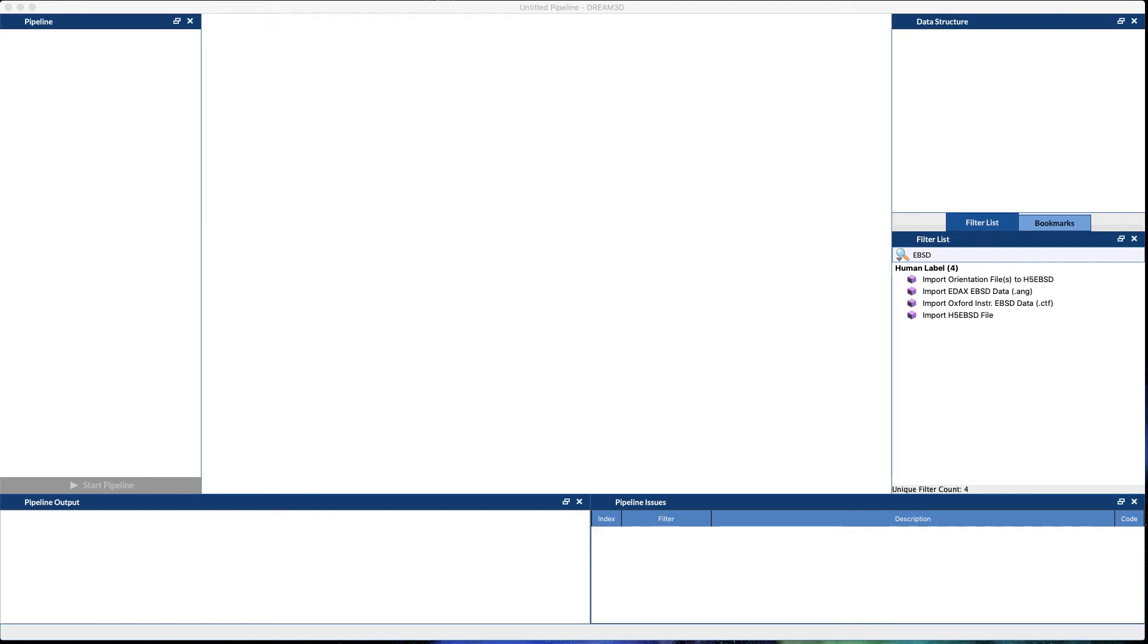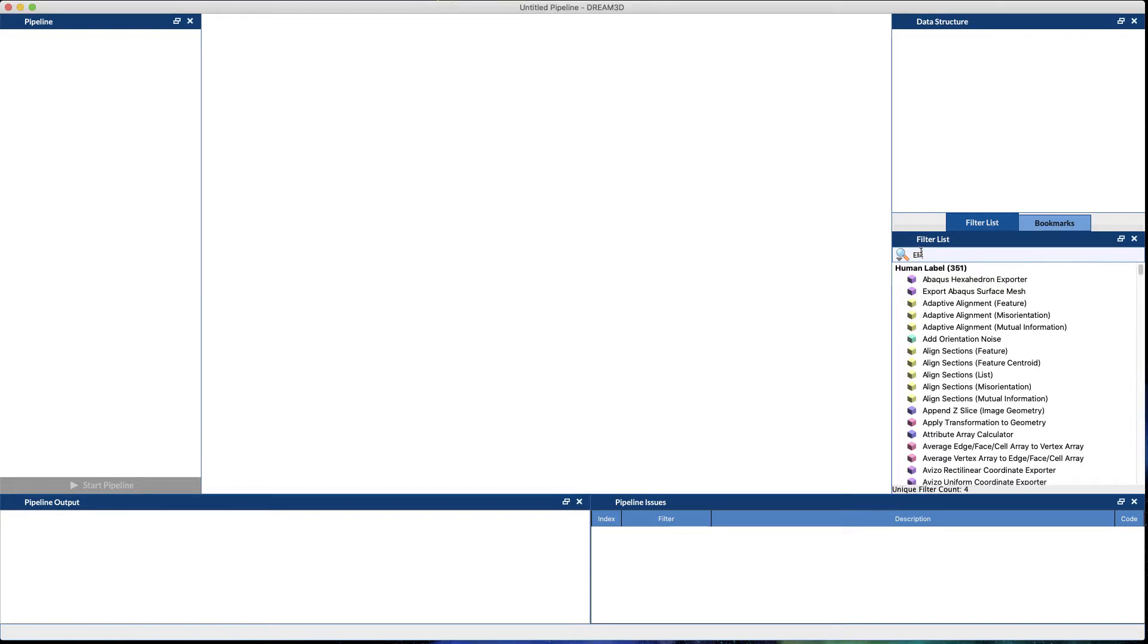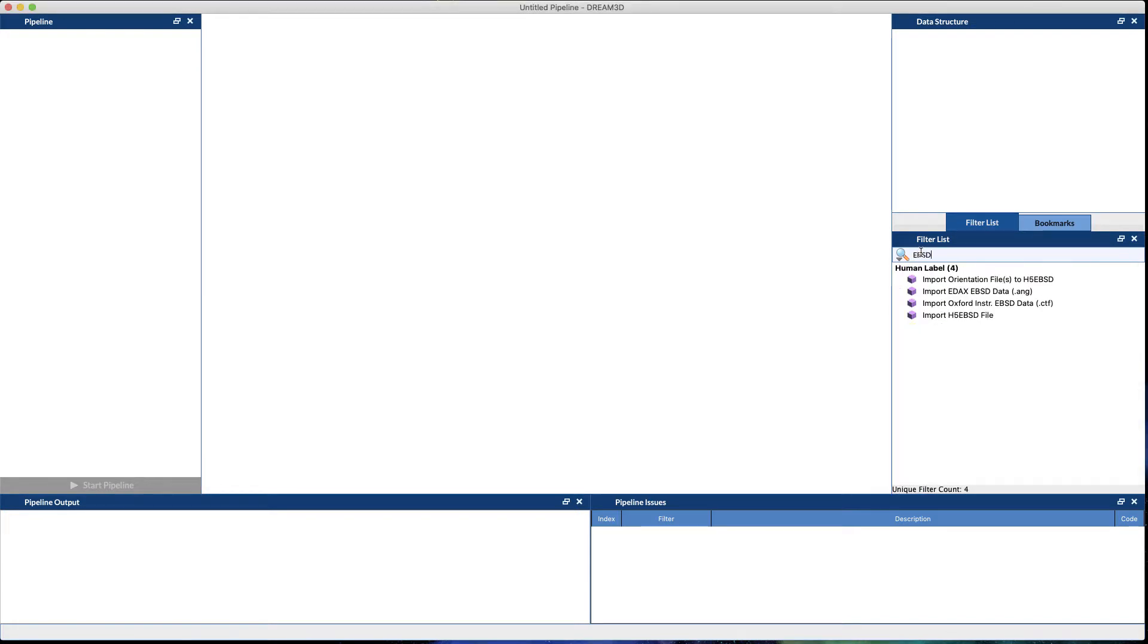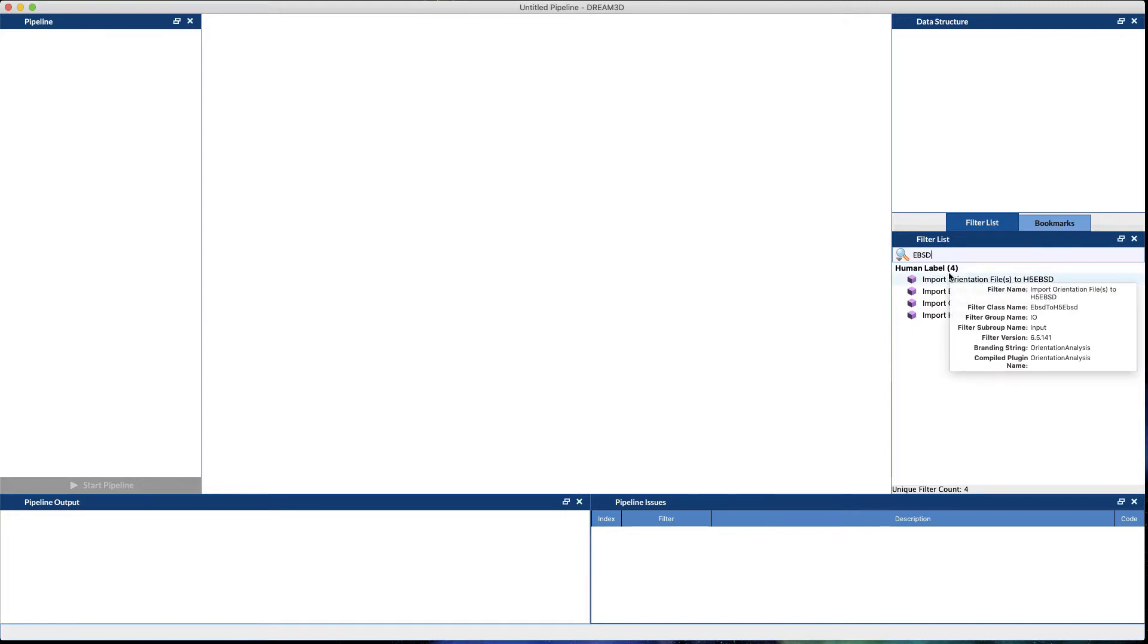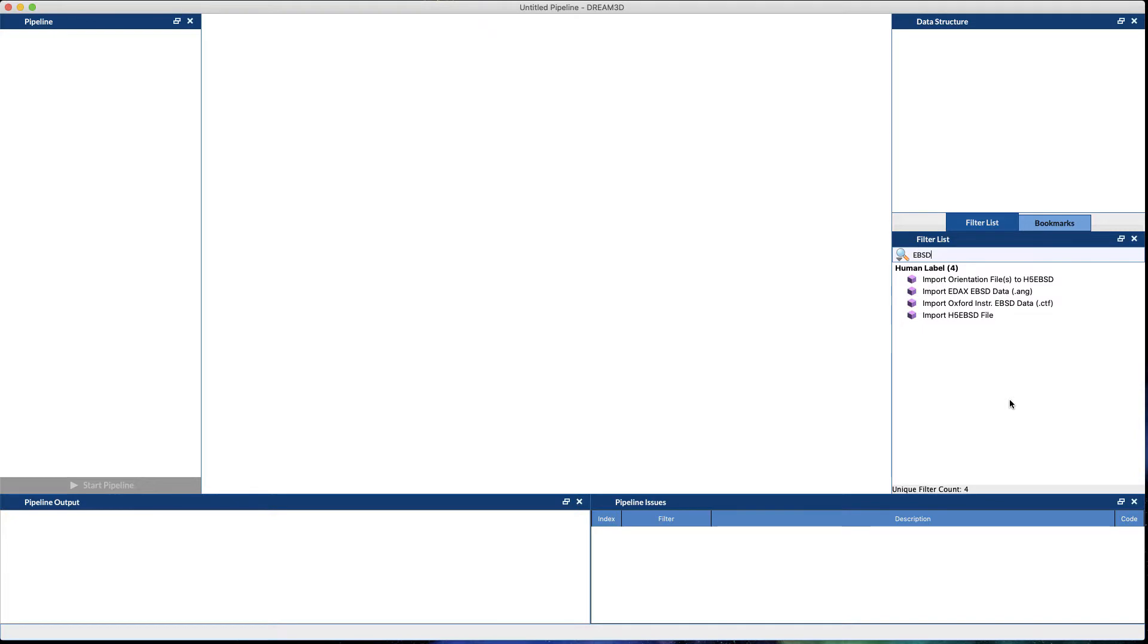In this video we'd like to discuss how to bring in some EBSD data into Dream3D and do some quick simple analysis on that data. First, if you go over to the filter list and you type EBSD, it'll show you the various filters that Dream3D offers in order to bring in the data the most quick and simple way.